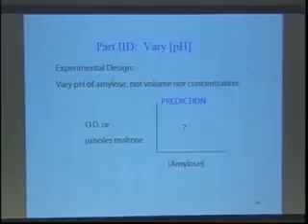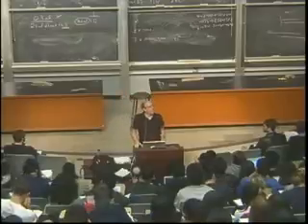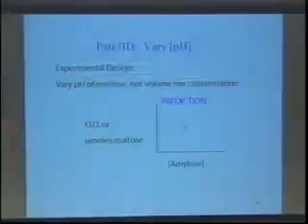So remember back when we did the pH and pKa, and is this protonated or unprotonated? So clearly the pH can affect the charge state of some of those groups, right? The amine groups, the acid groups, things like that. So what we're going to do is actually just test the pH. So you make a range of solutions here. And again, the variable here is pH, one parameter.